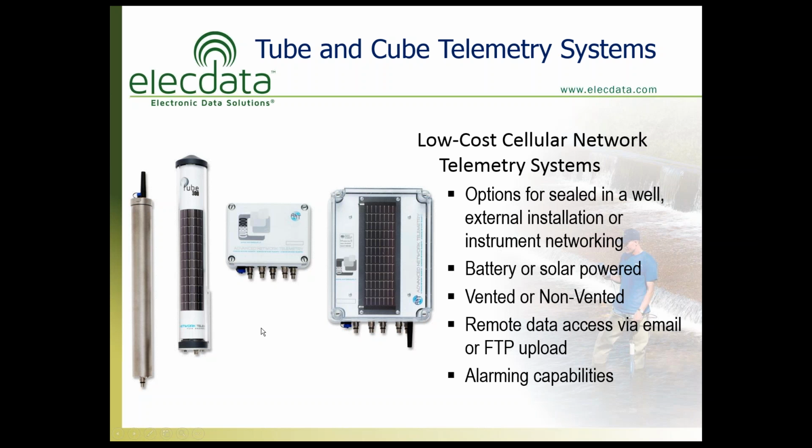So as it's reading your non-gauged or absolute sensor, it will compensate that data for the real-time barometric pressure, log both the uncompensated reading, the current barometric pressure, and the corrected reading, and send all that data back to the HydroView software for you to view and download.